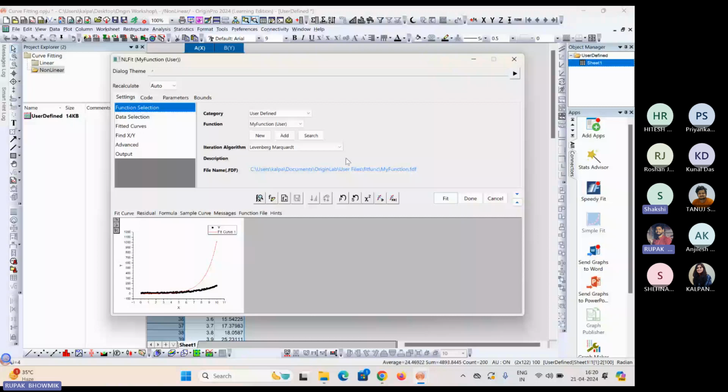For a graph you can do it, unless you have to do something user-defined. For example, in case the baseline is not straight, you have to select your baseline. In that case, you will be able to use your graph.